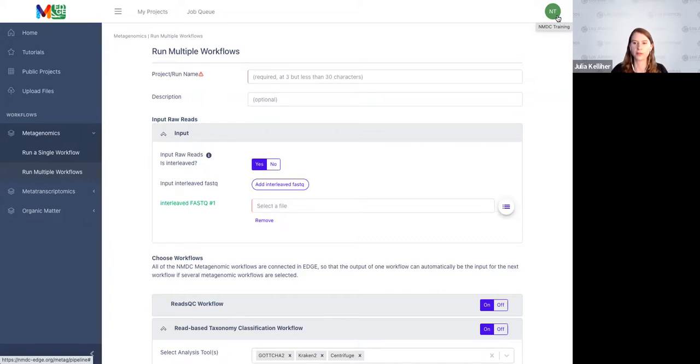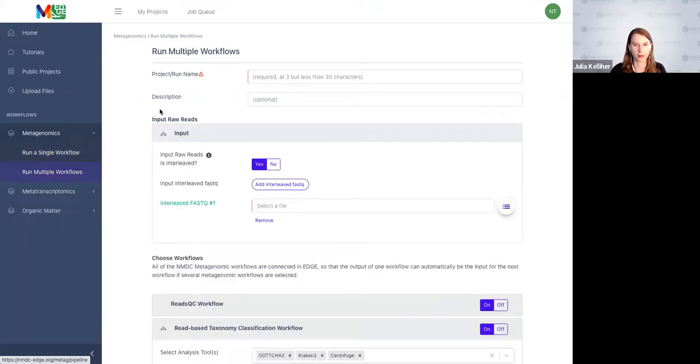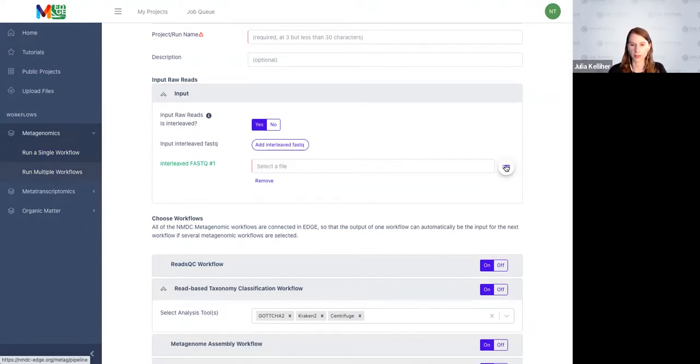So I can give people a few minutes there, and I'll just walk you through some of the test data sets that we have that you can pull from. So again, huge thank you to Mark and Michal and Jan and everyone else for pulling these data sets. So let me give you guys an example here.